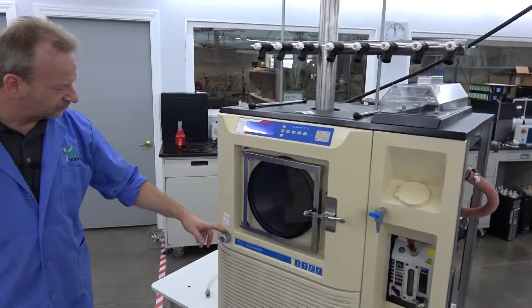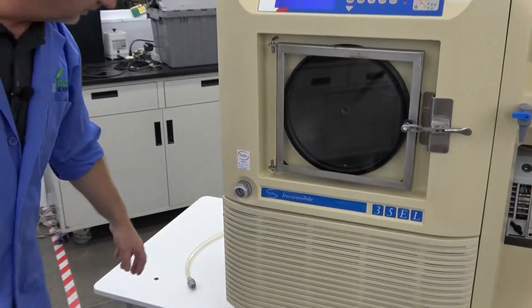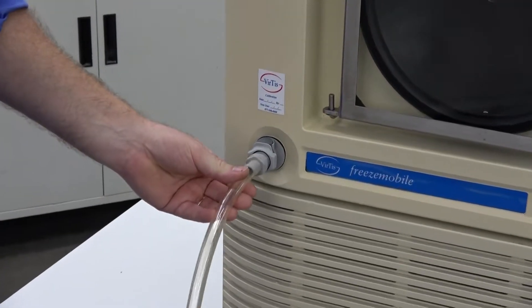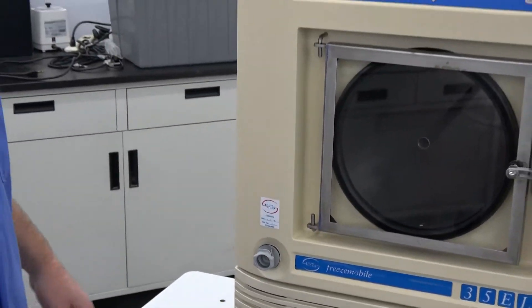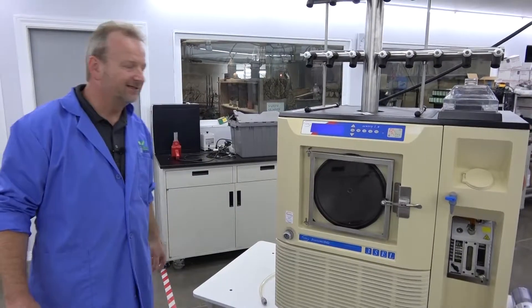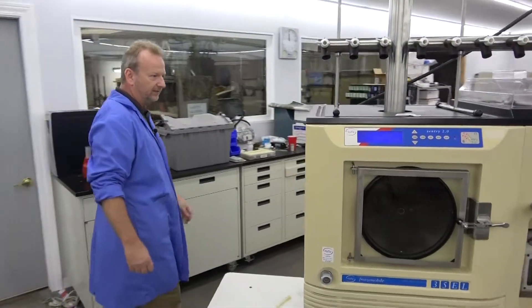We also replaced the drain quick connect plug here, because these become a little faulty sometimes. This is a quick way — plug it in and drain the moisture out of your chamber when you're defrosting. Just a few things to make sure the integrity of all the seals and the vacuum is operating at peak performance.